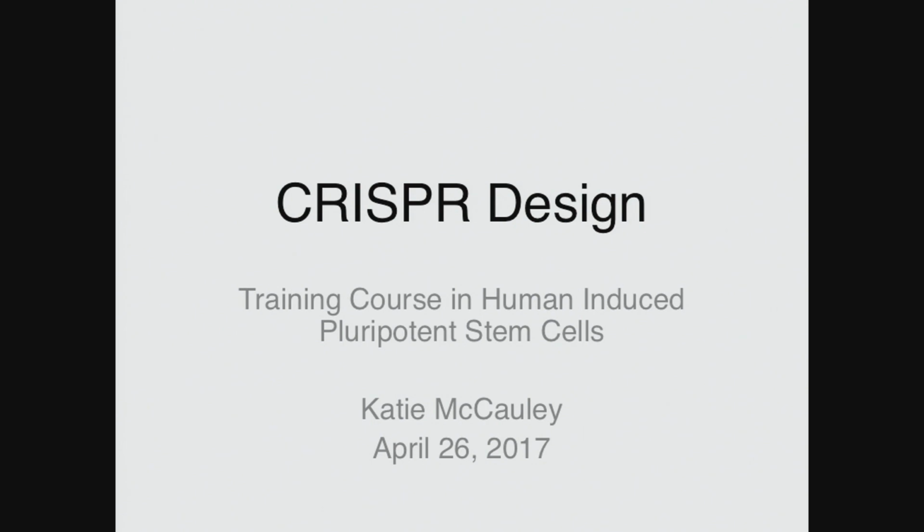CRISPR design. Basically, one of the main things I want you to take away is that this is just how our group designs and works with CRISPRs. There are a lot of different ways. Using CRISPRs is basically just a technique to do the gene editing that you're interested in doing. So I'm going to explain to you how we do it and think about it.